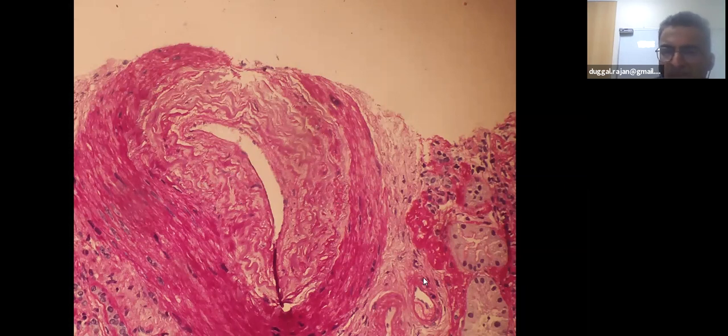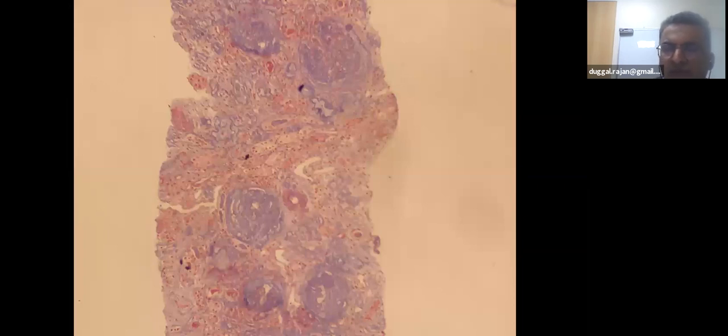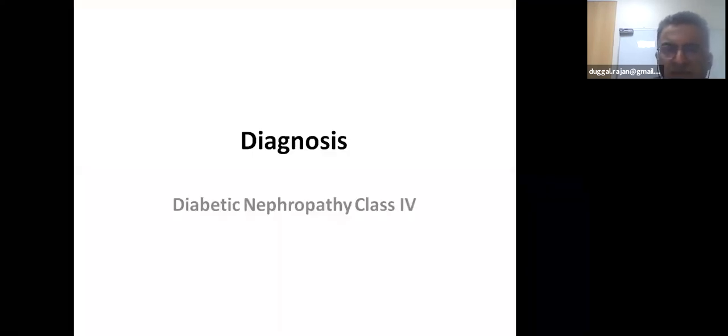So all these findings suggest a combination. Though many times we label it as only diabetic nephropathy, many times I say diabetic nephropathy with arterial nephrosclerosis. So what I mean is it is a combination of hypertension and diabetes causing that.